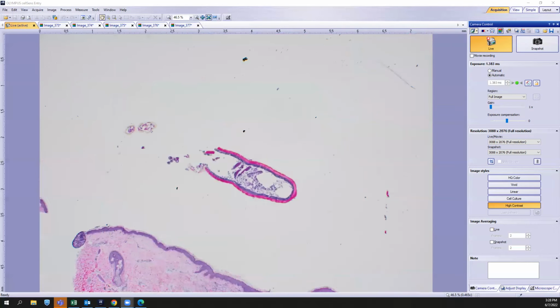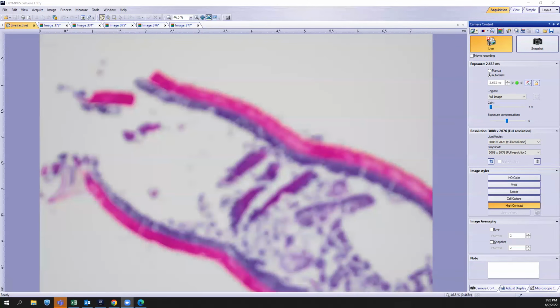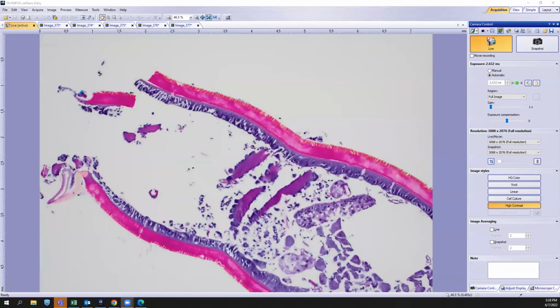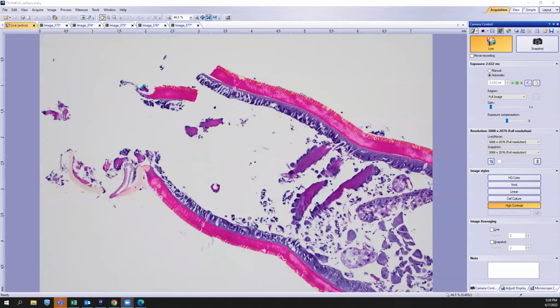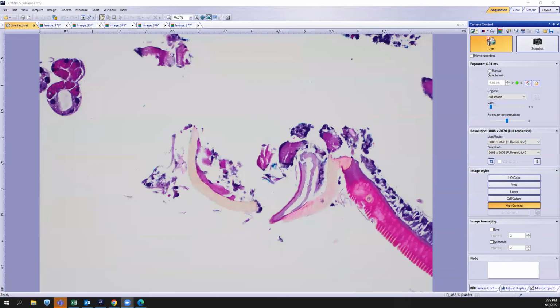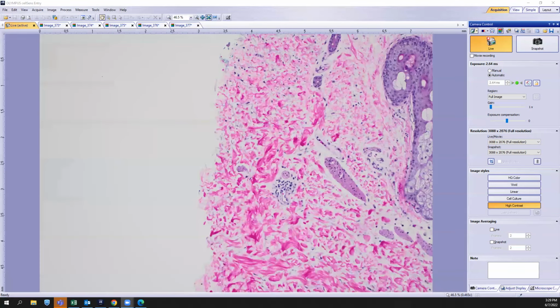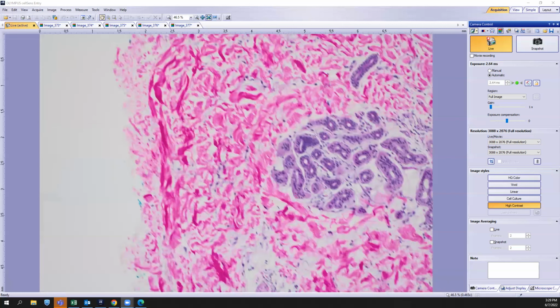So definitely could test you on this. So just be able to recognize the mouth part of the tick and be able to select the right answer. Usually they'll show you just these portions of the tick mouth, and they'll expect you to get it right, that it is a tick by itself.